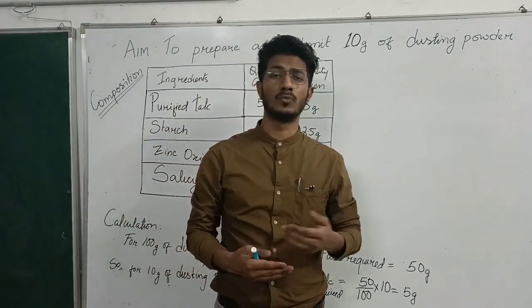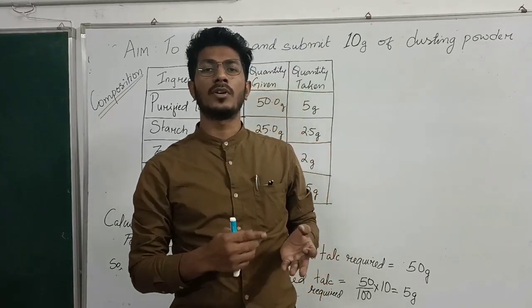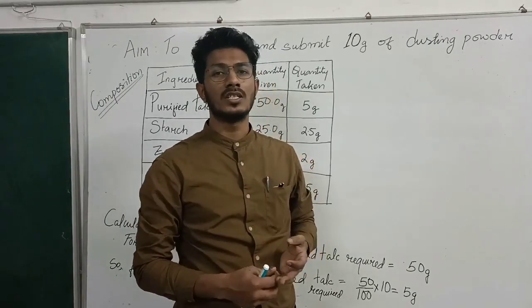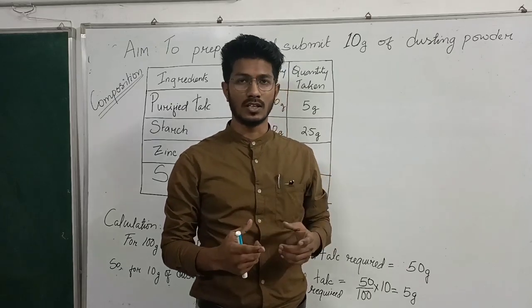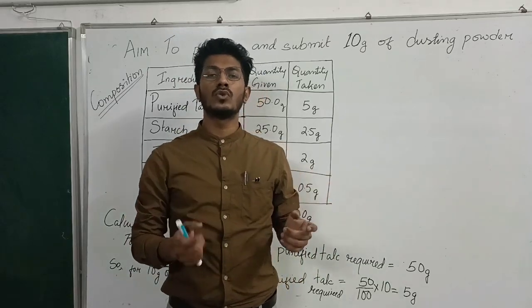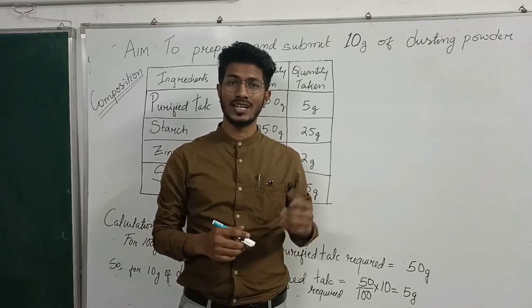So there are various mixing processes. जैसे आपका sifting हो गया, एक mixing process हो गया. फिर उसके बाद आपका trituration है, spatulation है, फिर geometric dilution is there, and then tumbling is there. To briefly discuss about them, sifting में आपका sieve use किया होता है, ठीक है? Sieve जैसे आपका छलनी वगैरह जैसे हमने दिखाया था, ठीक है? So we can use those to pass the granules, and then we can mix the powders, and we can have our formulation. So that is sifting.